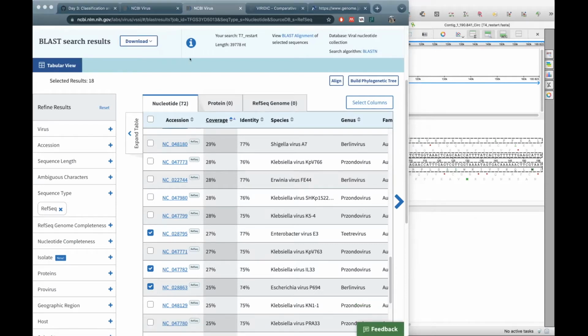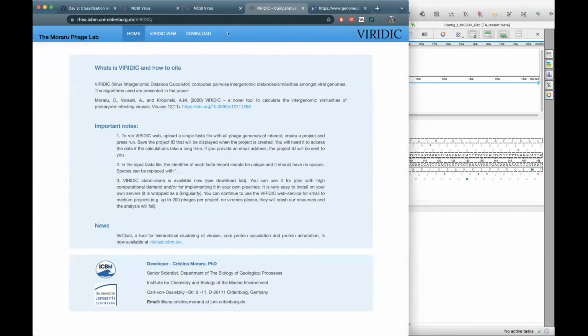If I now want to compare them, you won't be able to see that now, I'm guessing. I'm going to combine this with my own phage genome into one FASTA file. I will save. Okay. So what is the next thing that we're going to do, Hani?